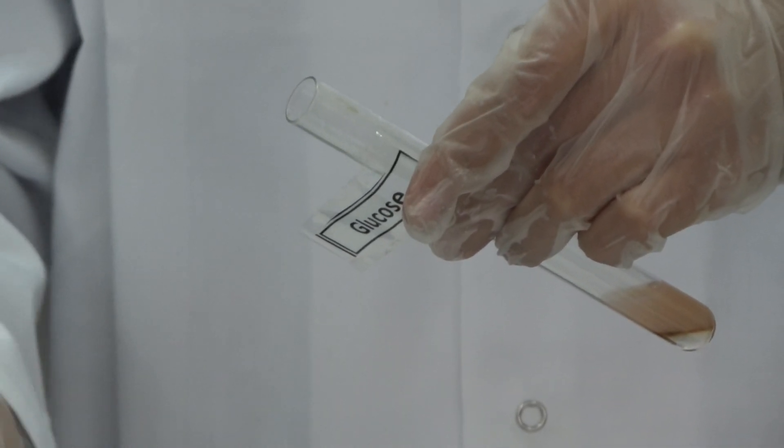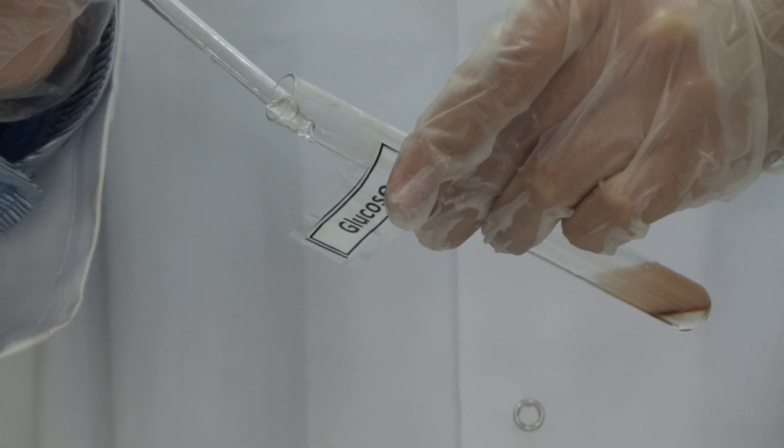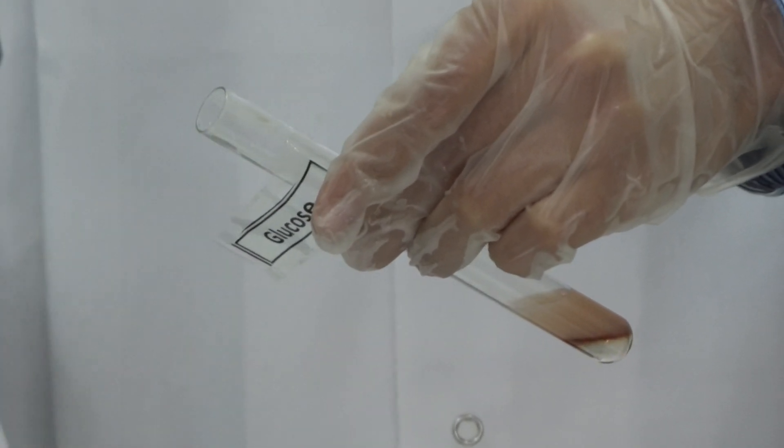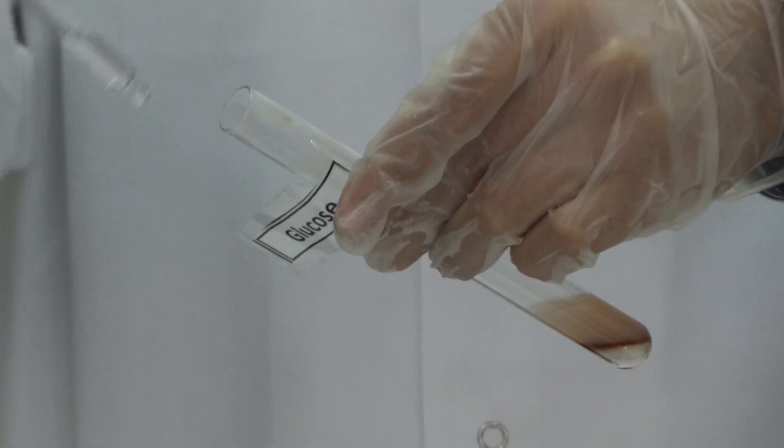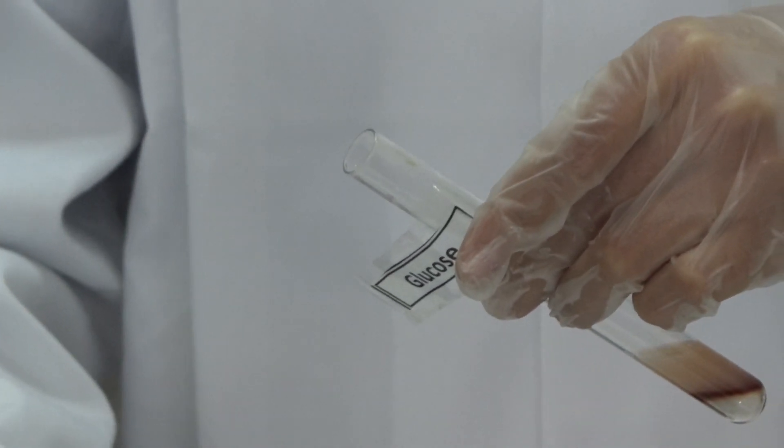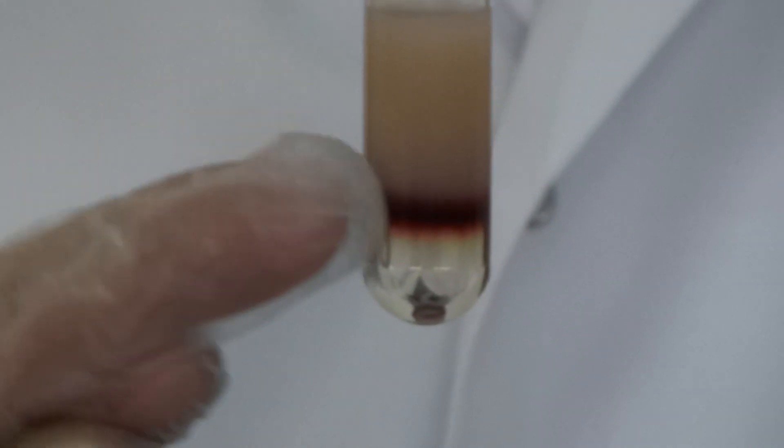Now, let's concentrate the sulfuric acid, so you can see clearly the violet ring. That's the one, and then, perfect. Now, slowly. What can you see? Violet ring at interface. Can you see it? Very clear. This is what you should get if you have a carbohydrate.